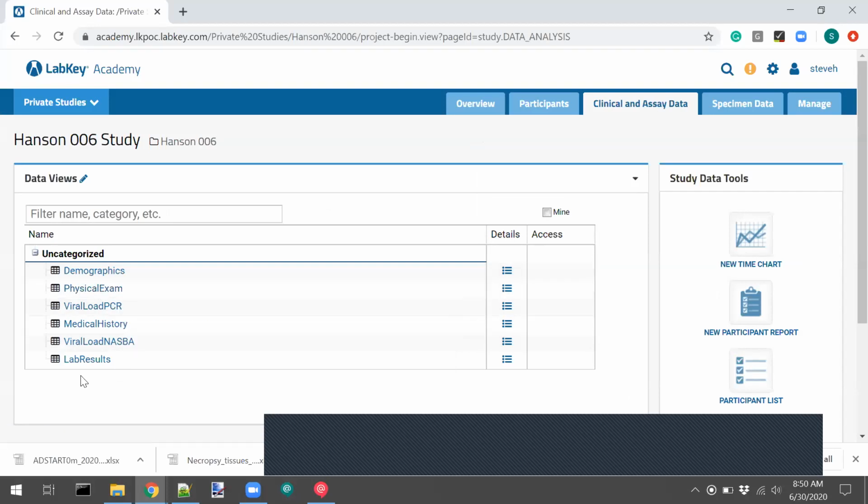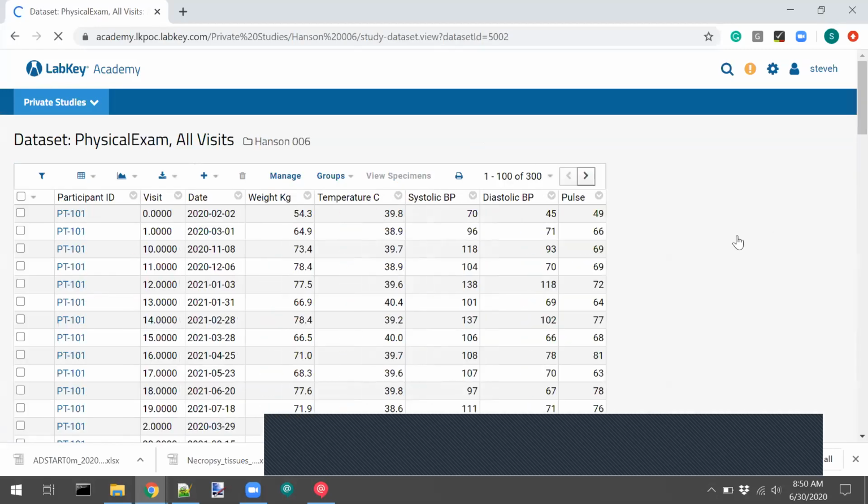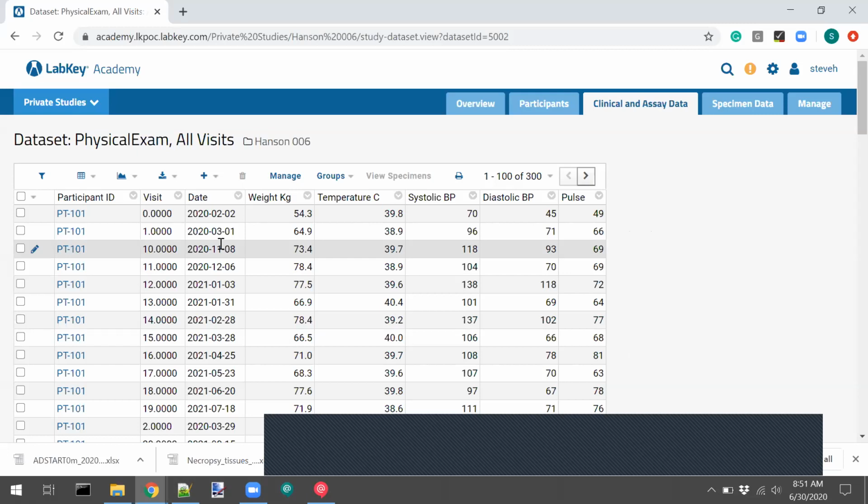One of the things that I would love to know is I'd love to get a sense of how people's health fares, how their vitals are faring compared to their white blood cell counts. Here I've got people's weight and temperature and blood pressure recorded. I would love to see one of the white blood cell columns inside this grid, and then start building visualizations on top of those.